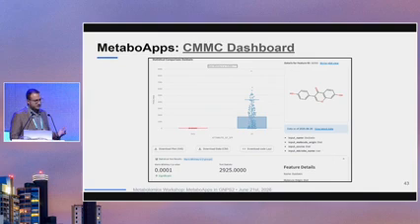As I mentioned, most of those tools, the library has always been increasing. So we are always implementing more information, more spectra, and more MS/MS spectra to that. So they are always increasing, and we might get more results if you do a reanalysis from time to time.